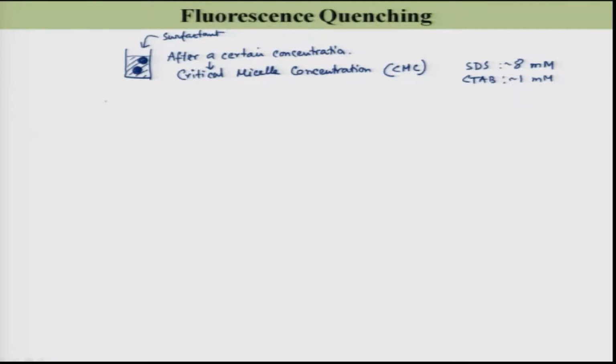Okay. Now, as I have drawn this figure, it consists of several surfactant molecules: number 1, 2, 3, up to n surfactant molecules actually make this micelle. The question is how I am going to determine this CMC value and the aggregation number.